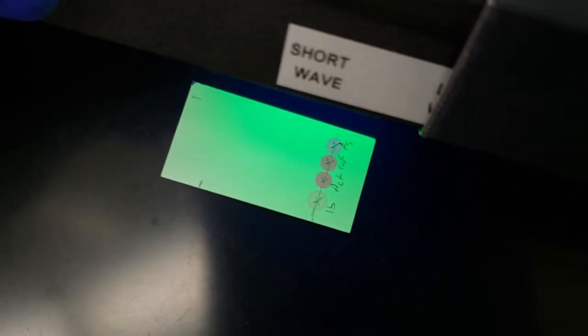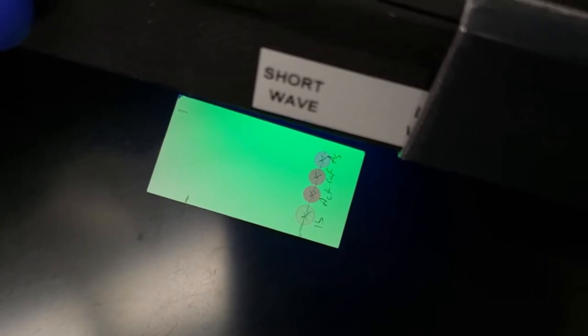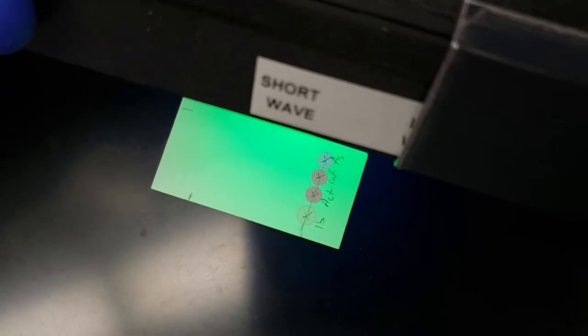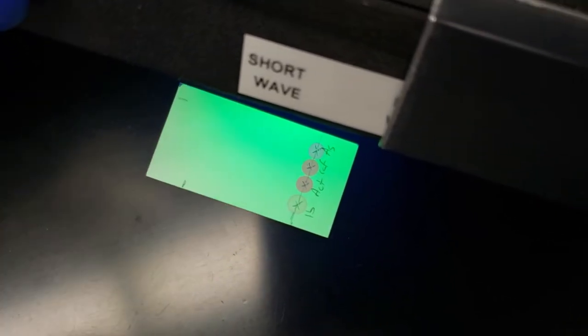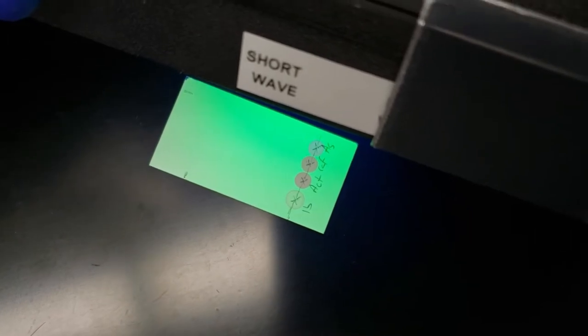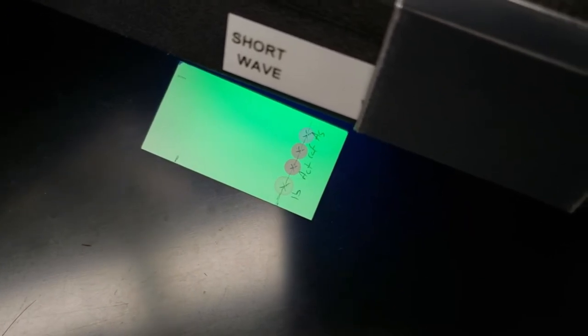Does that show up okay? Yeah. Okay. So we can see that our ibuprofen is fairly light compared to the others. We see clear and distinct spotting of our compounds here. So they're all at the starting line, ready to go. We'll go ahead and put our developing chamber together and run this plate and see what we get.